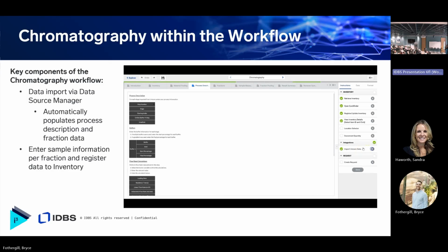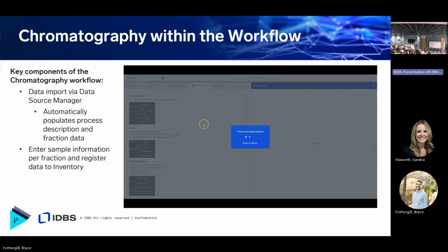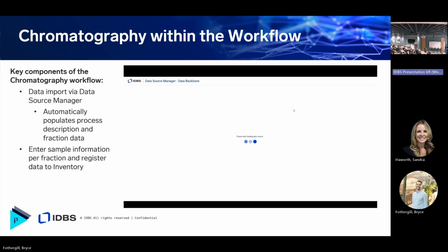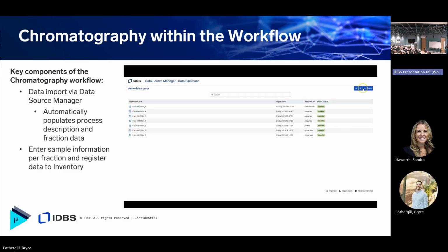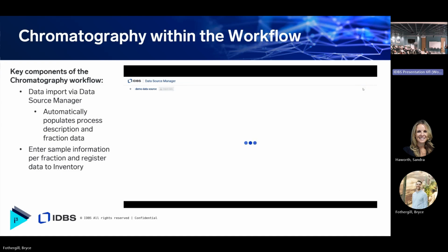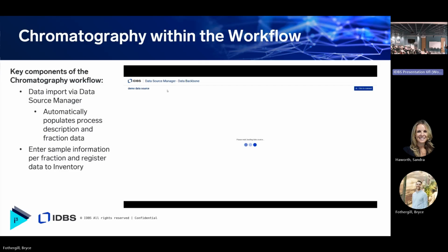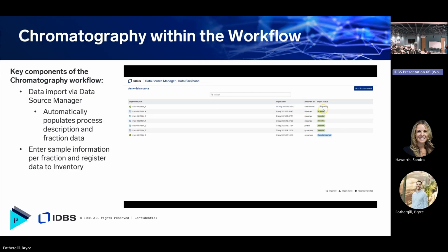So in this video, we're going to open up the data importer, which is a tool similar to Inventory Quick Finder within the web editor. Then this will open up the data source manager. This is a new end user interface tool that is used for both administrative purposes of connecting to the integration, and it also allows users to actually add and select this data. So that's what you're seeing here, a user selecting this run data and importing it into the data importer.